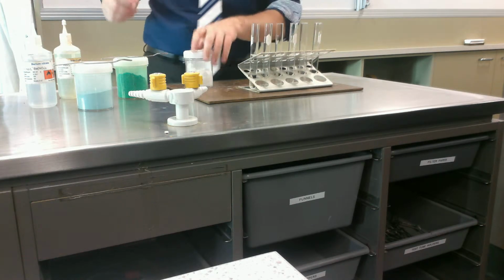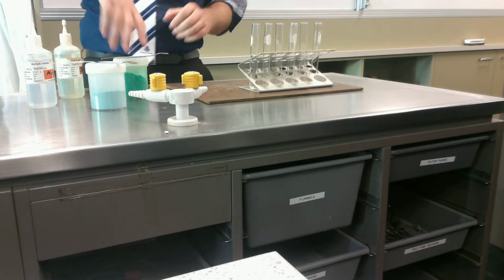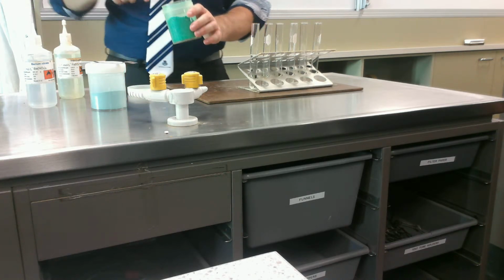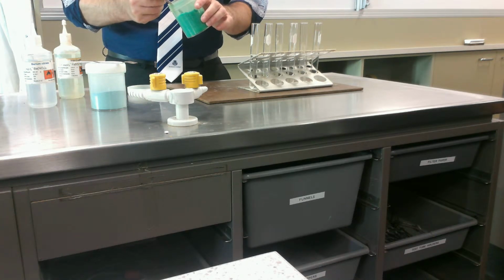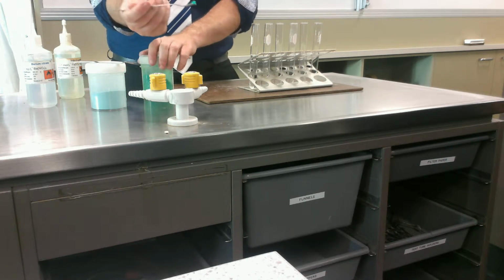Okay, let's have a look at a different one because that was pretty lame and boring, to be honest. What we're going to look at next is copper chloride. So that means we've got copper chloride crystals in the spatula. I won't use quite so much because it's not quite as soluble as the other one. How would we describe this one? What does it look like?